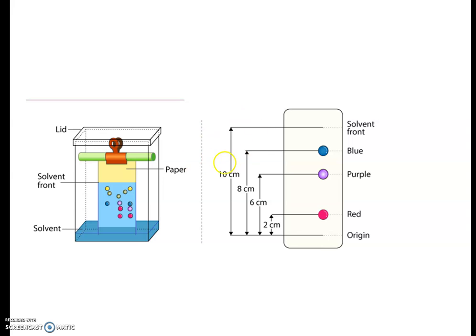This is the experiment setup of the paper chromatography. Here you can see a paper which is the stationary phase. Here the solvent which is the mobile phase. So we will put a drop here first, then dip it in the solvent. So the solvent will absorb on this and it will move. This is the experiment setup.